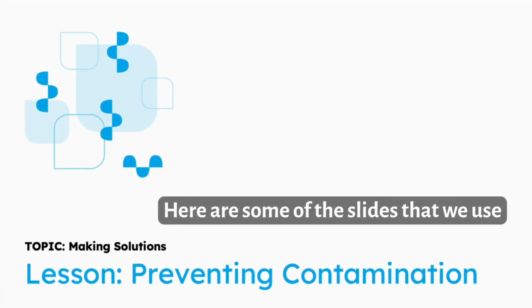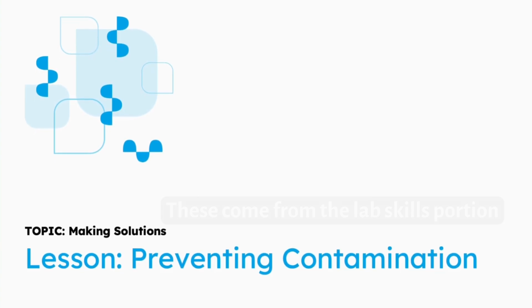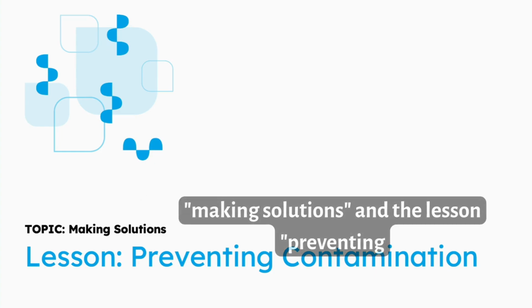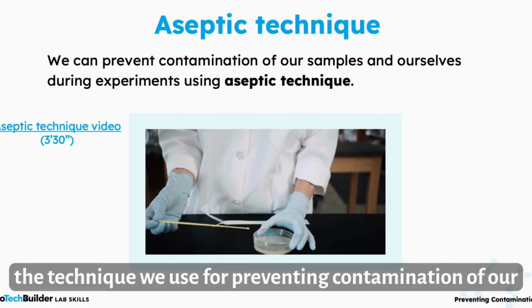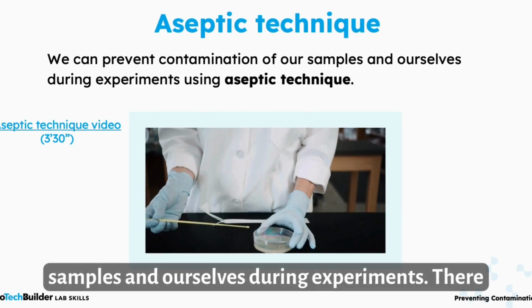So let's get started. I'll use some of the slides that we use for teaching aseptic technique. These come from the lab skills portion of the BioTechBuilder curriculum, in particular the topic making solutions and the lesson preventing contamination. What I'd really like to concentrate on is the aseptic technique itself, and that is the technique we use for preventing contamination of our samples and ourselves during experiments.